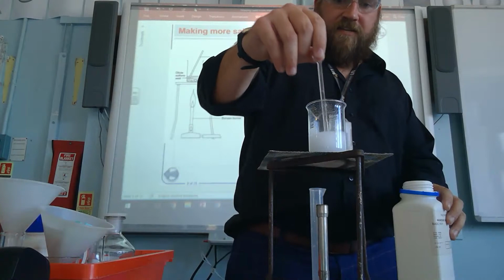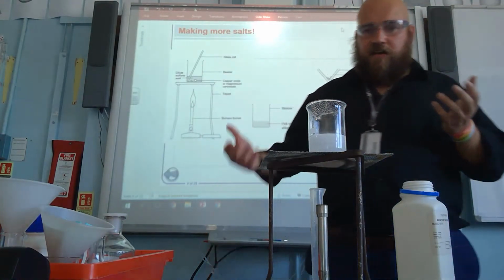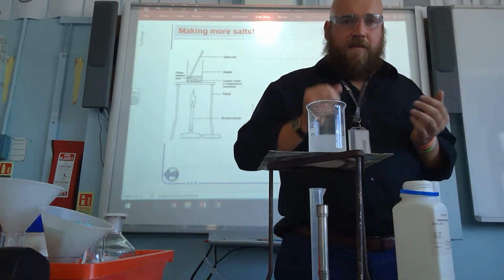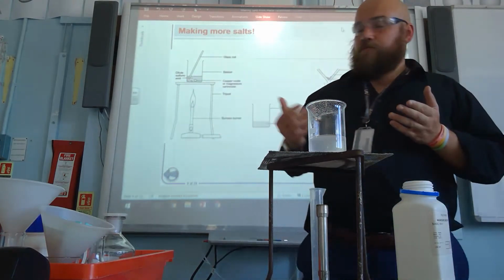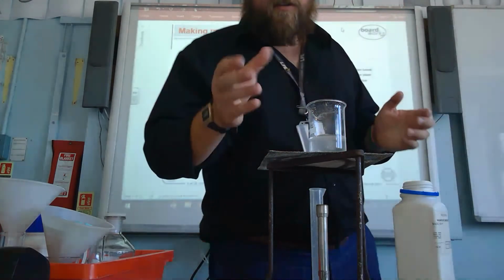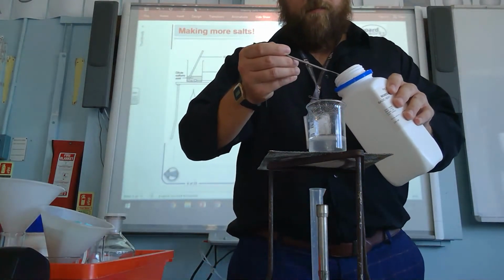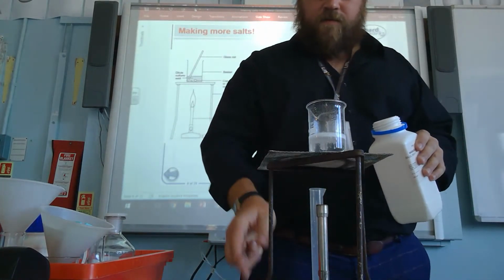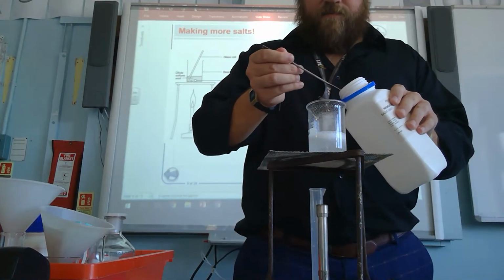And one thing you'll notice, all right, is the color of the solution. It's not turning a lovely blue solution like the other day when we had copper sulfate. We're making magnesium sulfate. And magnesium, just like calcium earlier, is in group 2. It's formed a colorless solution. So again, I can't see any solid at the bottom, which means it can probably take a bit more. So again, I've just got to be very careful not to over add it.